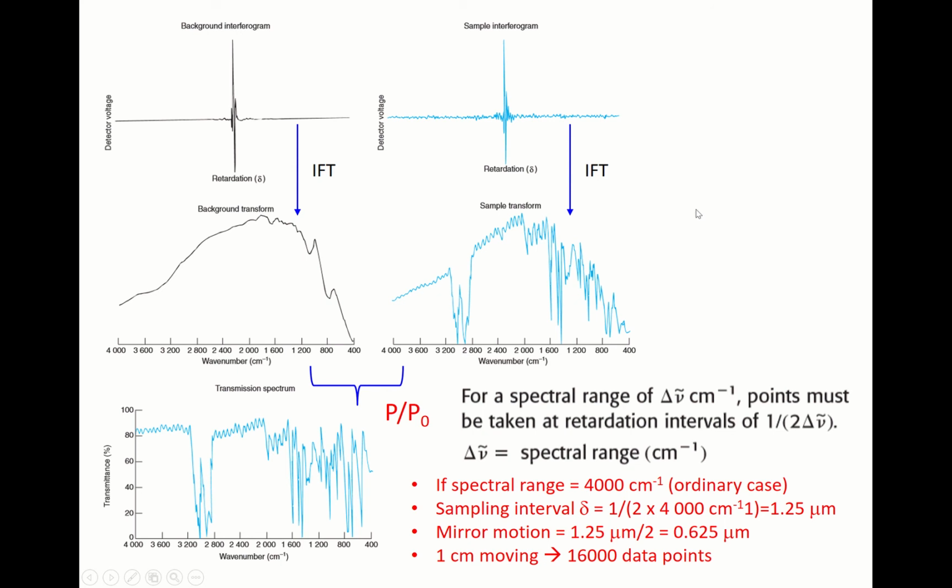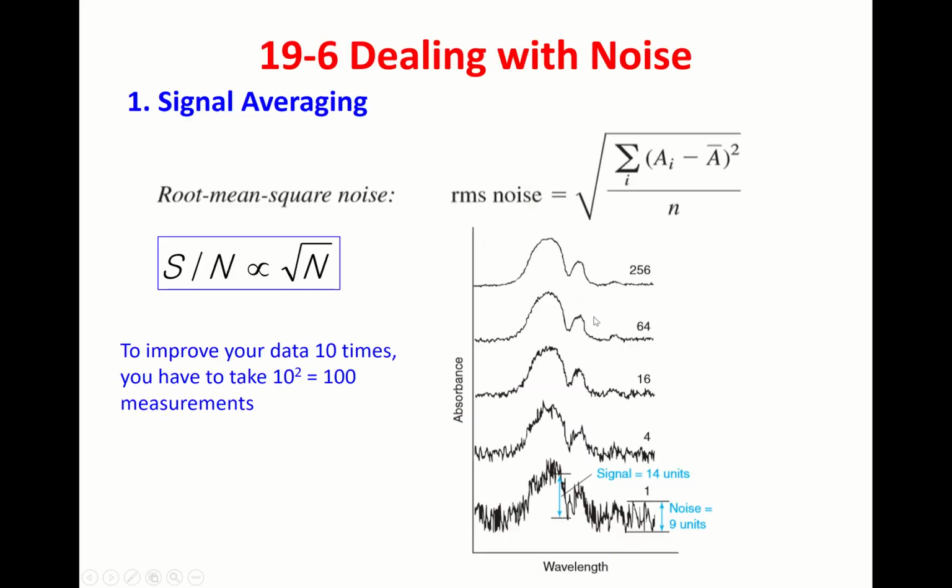By that algorithm, you can do the inverse Fourier transformation very fast. That algorithm is amazing. That's the basic idea of FTIR.